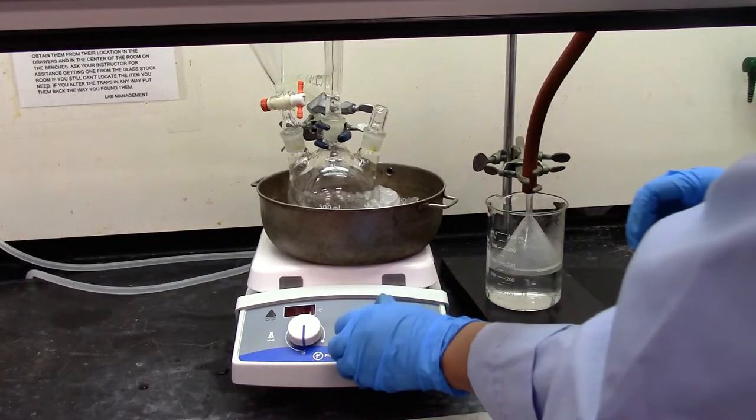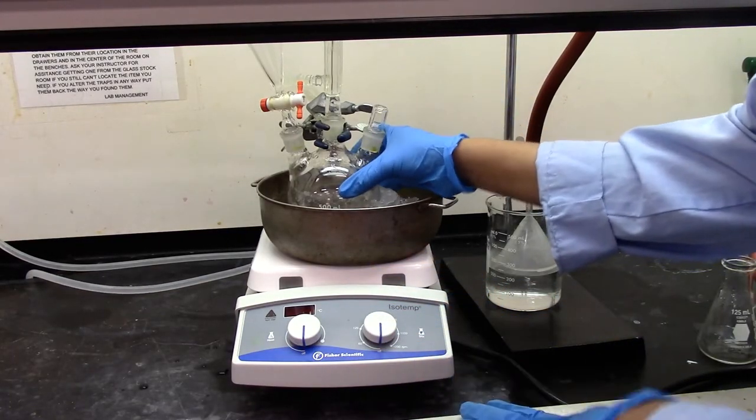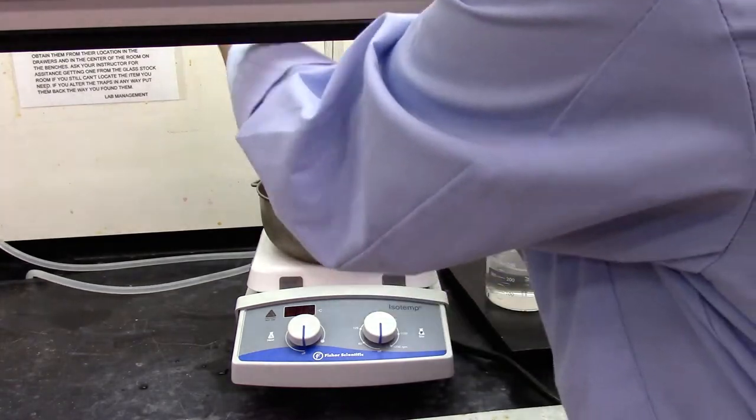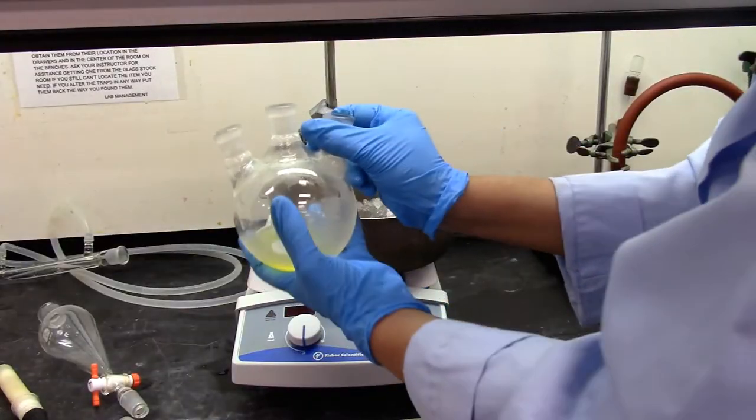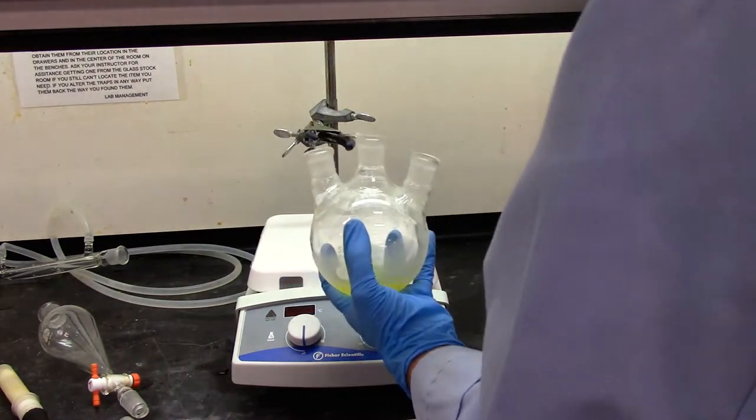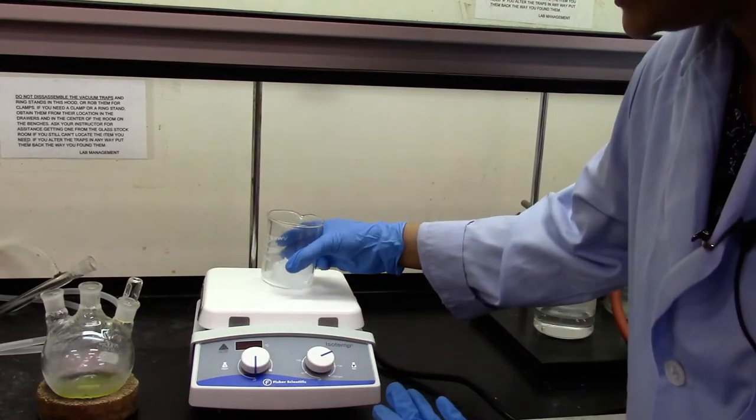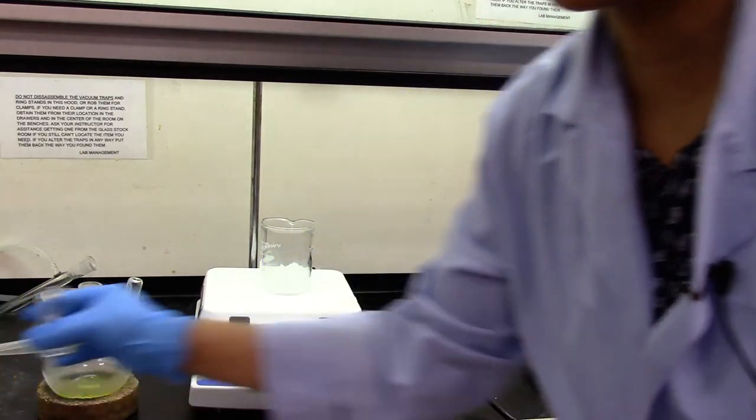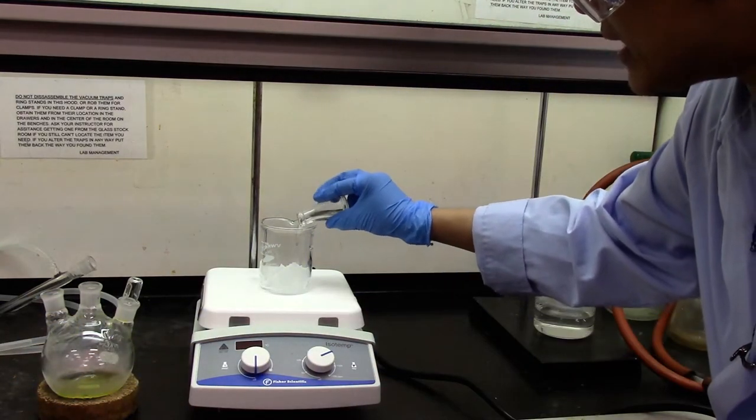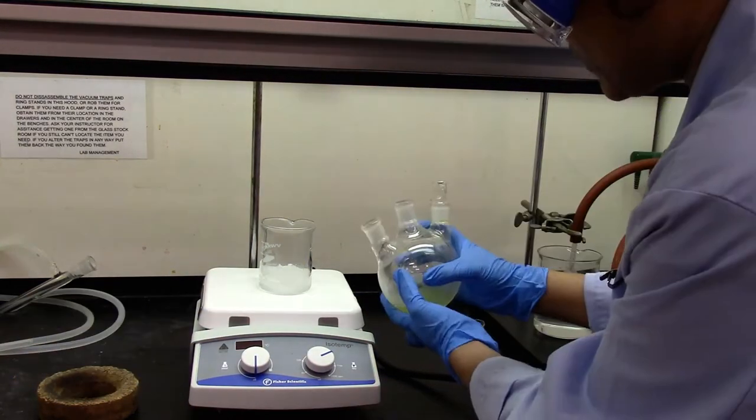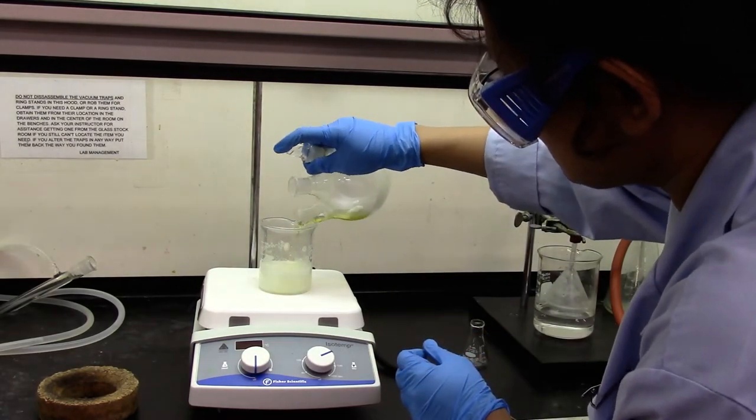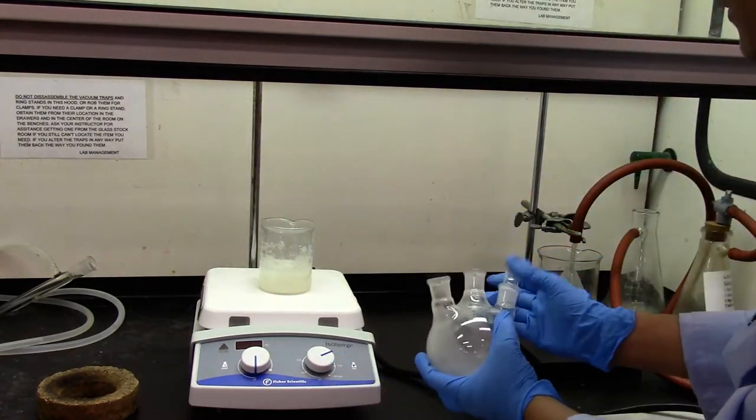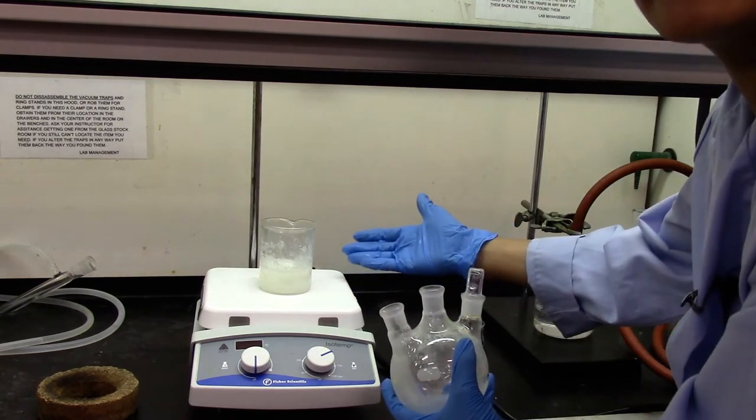We're going to stop the stirring and take out the round bottom flask. So here's our product mixture. Here's my 25 grams of ice. I'm going to add about 13 mL of concentrated hydrochloric acid. Transfer the reaction mixture with the stir bar into the beaker. I will let it stir for about 15 minutes.